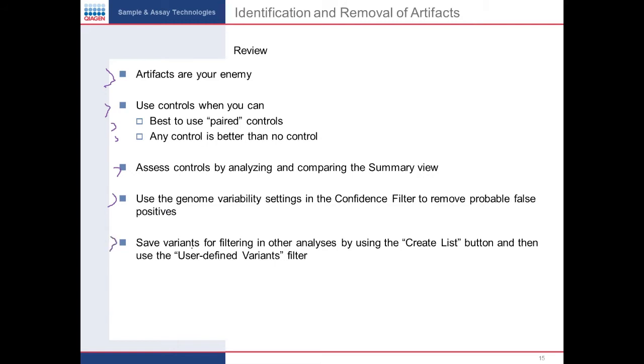And then if you want to create your own filter, you can set up an analysis of just your controls and create a list like I just did, which will always be accessible in other analyses. The reason you would want to do that rather than including those controls every single time is that when you start including 100, 200 controls in every analysis, it does slow things down. It'll slow down your analysis time and your filter changing time. It's not that we don't have high performance machines, but you will see the degradation. It makes a big difference if you have 100 versus 200 samples.